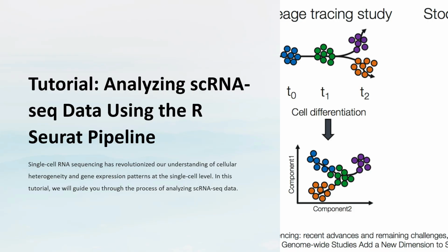In this video, we are going to see how single cell sequencing works, what the basic pipeline of it is, how we can use the R tool to analyze single cell sequencing data, and where we can get the data as well.